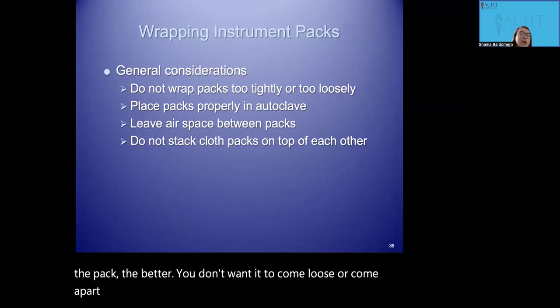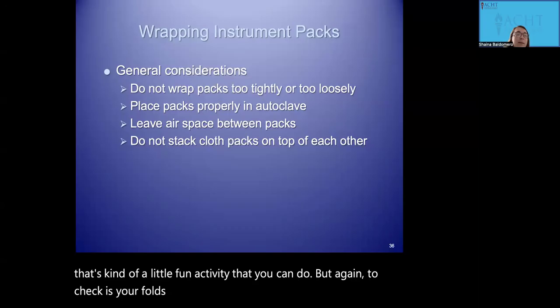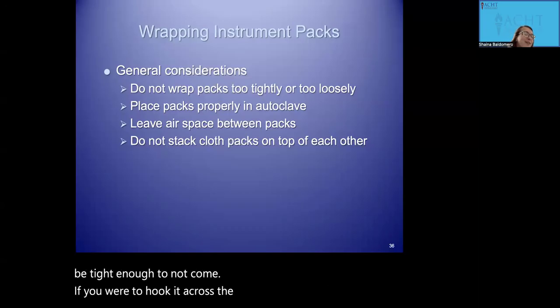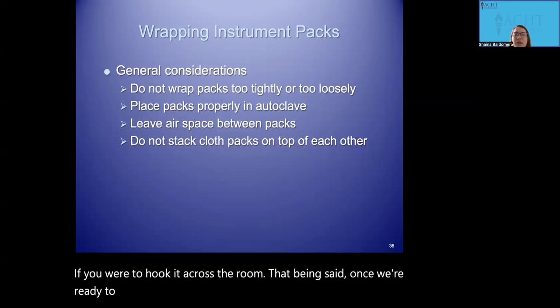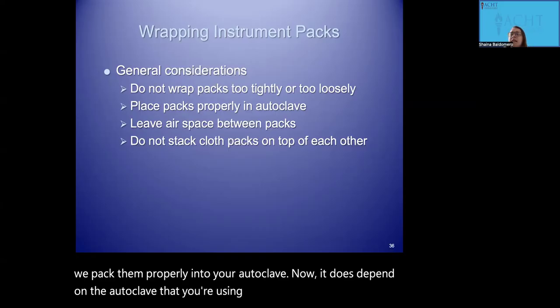Again, you guys saw me throw it at the door at the end. And that's kind of a little fun activity that you can do. But again, to check, are your folds actually tight enough to hold up? They should be tight enough to not come undone if you were to huck it across the room. That being said, once we're ready to place these into the autoclave, we want to make sure that we pack them properly into your autoclave. Now, it does depend on the autoclave that you're using. I'm going to show you in the next 2 slides.